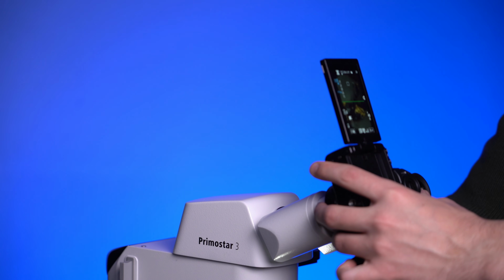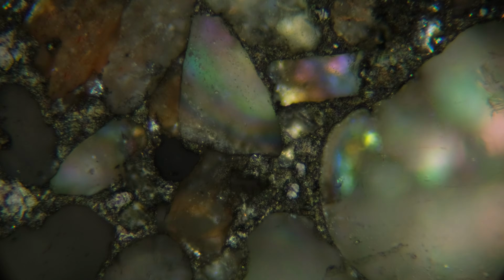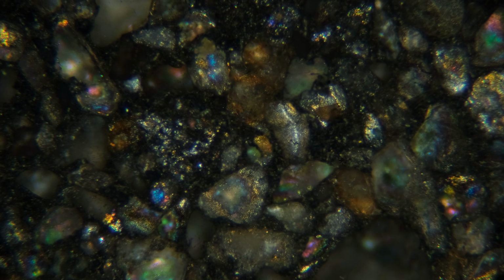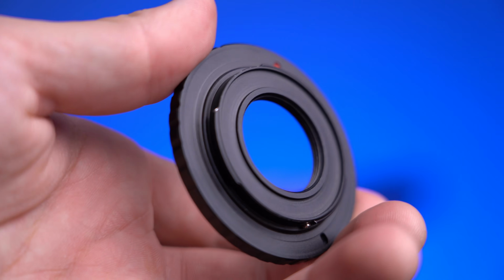It's less convenient, but there's even a bonus. Without a beam splitting prism, the image is brighter. You can use lower ISO, which is especially useful for polarization or dark field microscopy, where light is limited. But that's a topic for another video. If you do have a trinocular tube, all you need is a 1x C-mount adapter, no lenses inside, the cheapest one, just a metal tube, and a camera mount adapter.